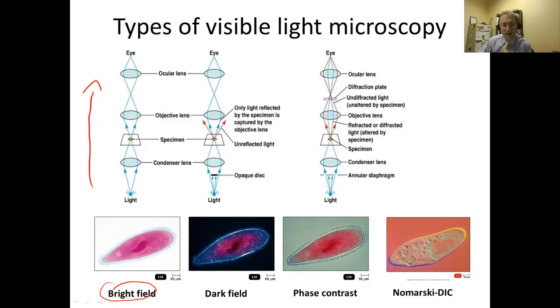Now, with standard bright field microscopy, because microorganisms tend to not have much in the way of contrast on their own, if we're looking at a living microorganism, it would probably not show up in this bright pink color. In fact, there might be extremely little to be able to see at all. We'll see in the next picture exactly how that works out.